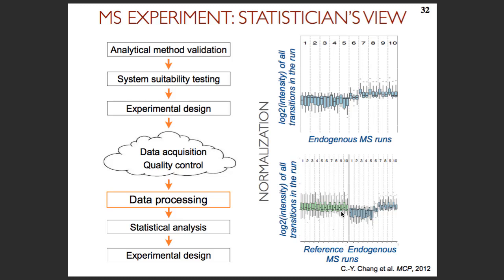And so by the way, maybe it's a good time to talk about this when we talk about batch effects, right, and data acquired at different time points. People say, can't we just normalize this away? You know, we can just have a normalization. These normalizations make super strong assumptions, such as every protein is affected the same way by the same amount across batches. It usually doesn't happen. And so our results reflect our assumptions a lot more than they reflect the actual biology.